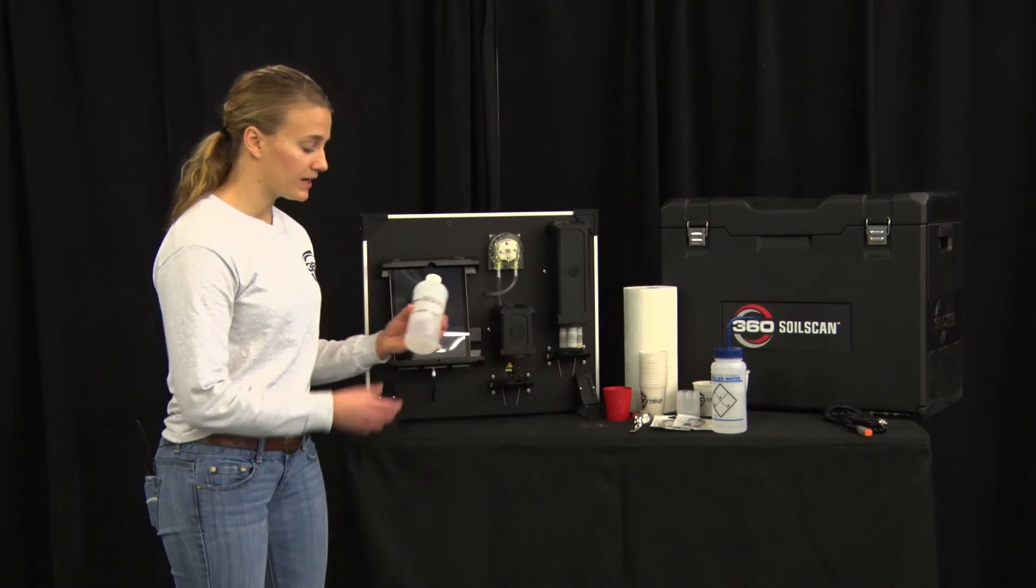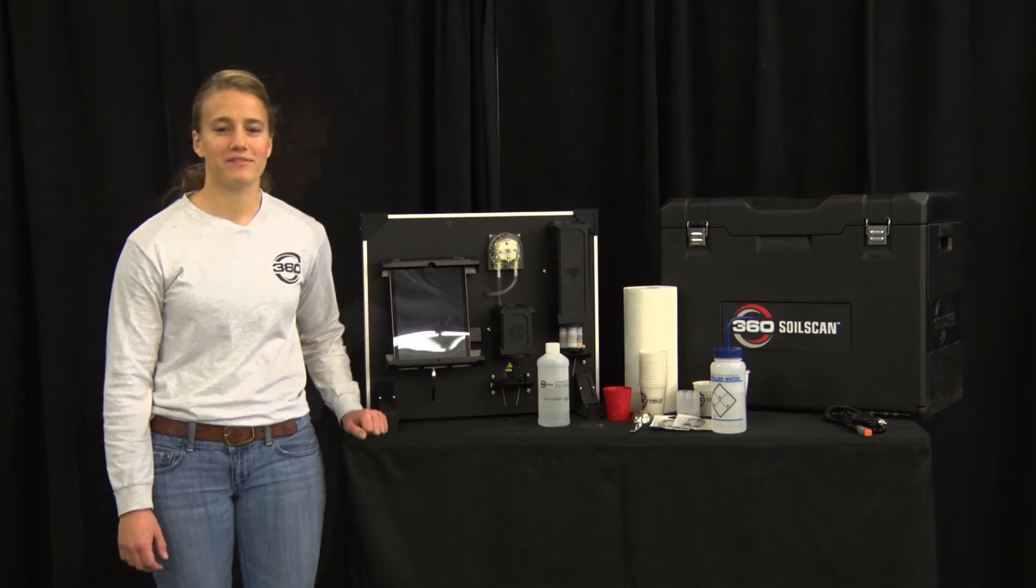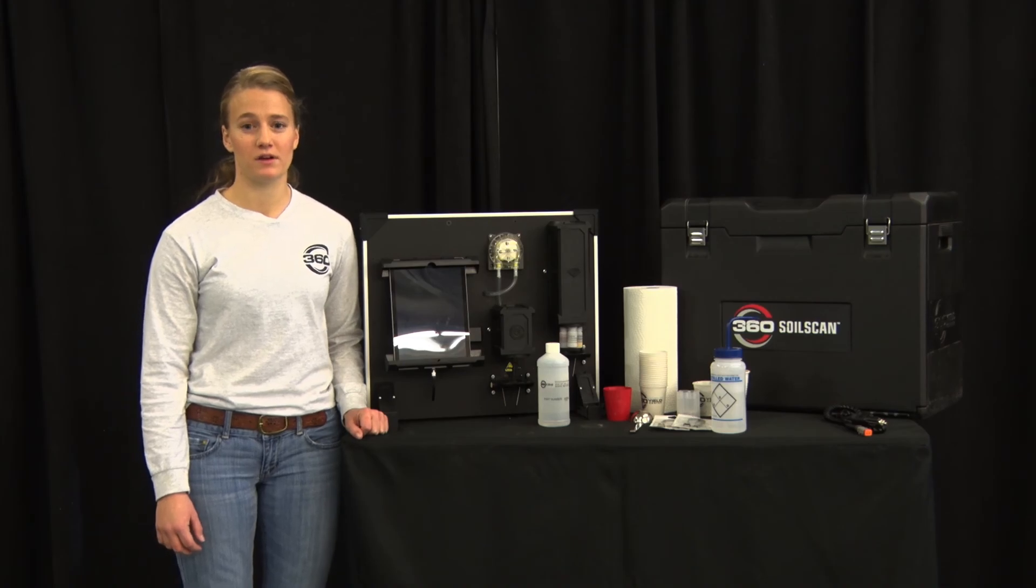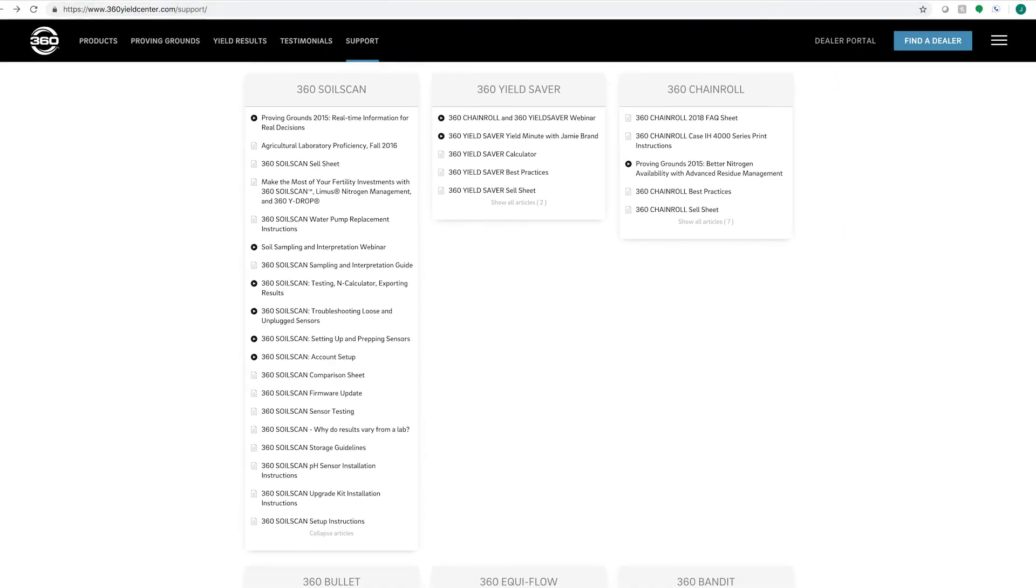You'll want to store your nitrate solution, any unopened bottles, the same as you would your soil scan. By following these basic operation instructions and storage tips, you will get the best use out of your soil scan. For additional information, such as pulling soil samples, refer to the support page at 360yieldcenter.com.